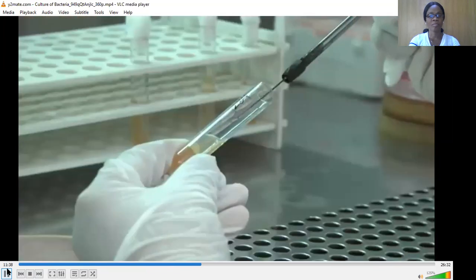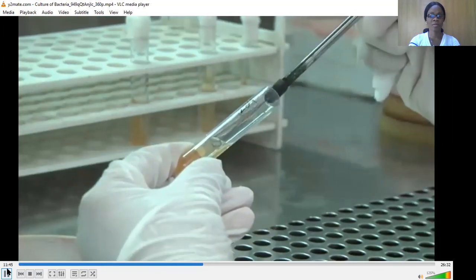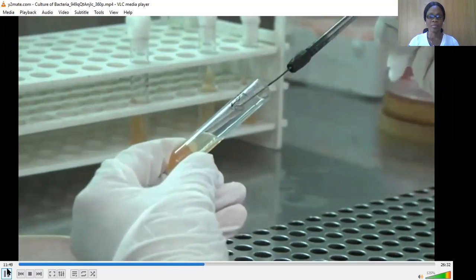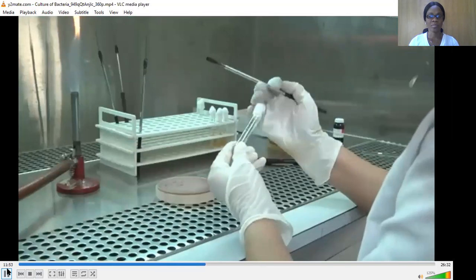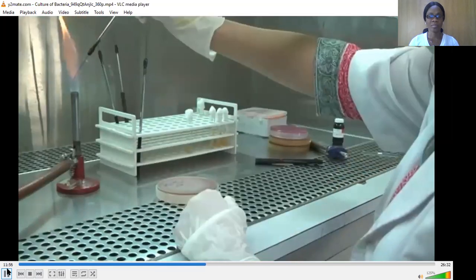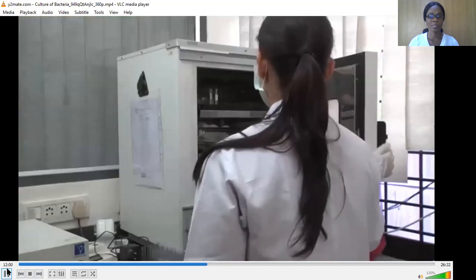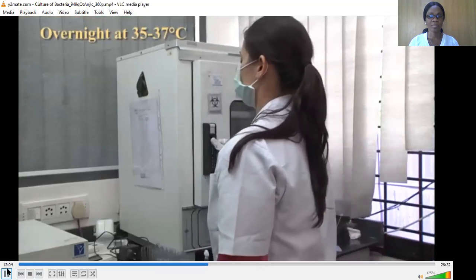Then, using the loaded inoculating wire loop, gently streak across the surface of the slant in a zigzag fashion, taking care not to break the agar with the loop. Flame the mouth of the slant again and replace the plug or cap. Sterilize the loop after the inoculation. Incubate the agar slant medium overnight at 35 to 37 degrees centigrade.